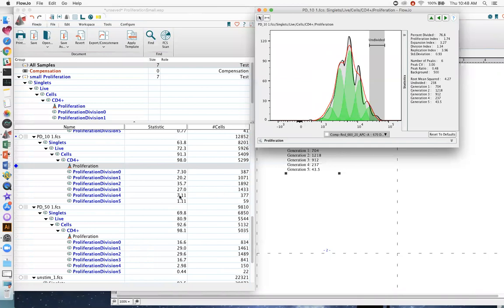And then the last question here is, how many cells or events should be at least in one generation to have a good, accurate modeling? Ooh, how many cells should be at least in one generation to have?